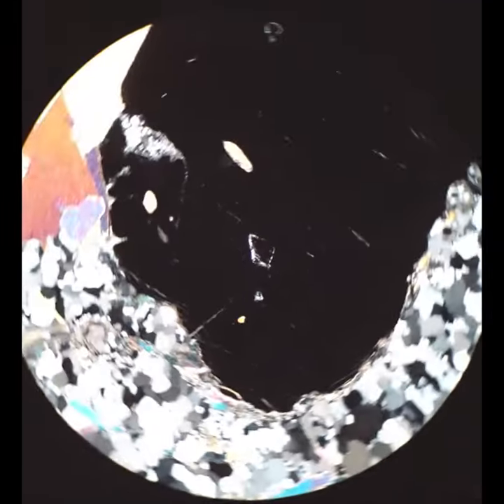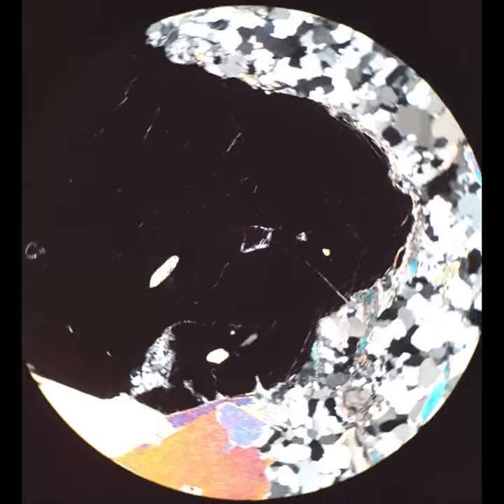Now, there was a coesite crystal in there. It got plucked out when the thin section was made. So now it's just epoxy, and that's what the black core to that ring is.